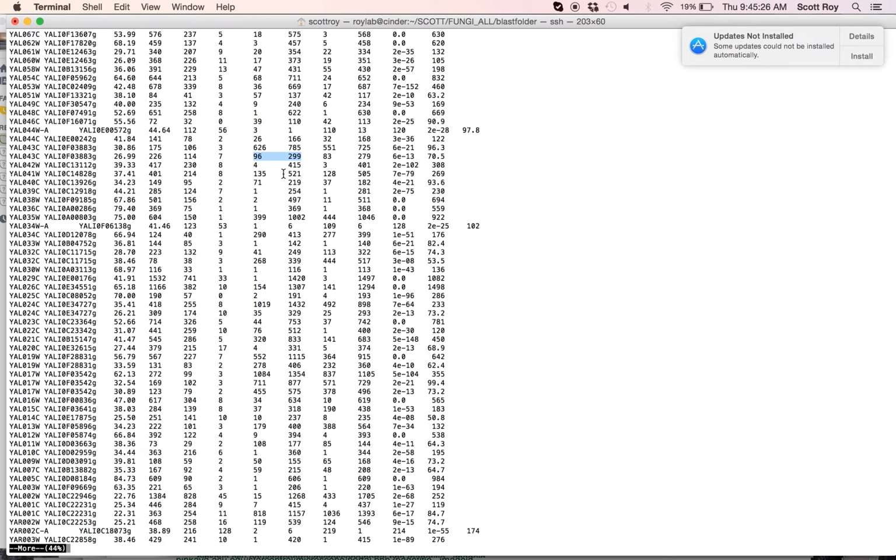So I think that's all. I guess, no, while we're here, if you're bored, you can stop. I'll teach you one more thing for those of you who are interested. Remember we saw that there was this thing where when we were using a normal BLAST, not with M8, that it would filter out repetitive sequences in our query sequence, turn them all into X's. If we don't want that to be the case, we can tell it, so F for filter, and we could say false. So FF, please do not filter.